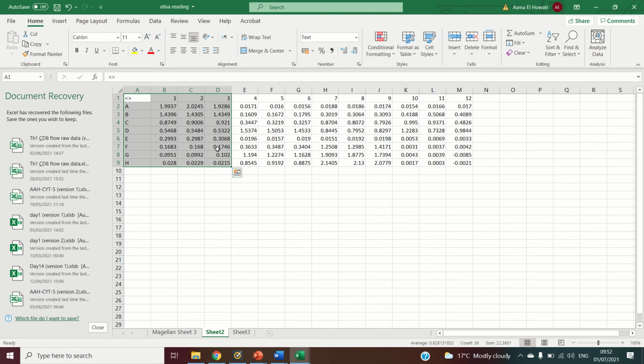So what I will do is that I will plot a standard curve using my absorbance values of the known concentration of the standard, and then I will use that plot to estimate the concentration of the specific material in my sample. So this is the point of doing this analysis or standard curve with ELISA.